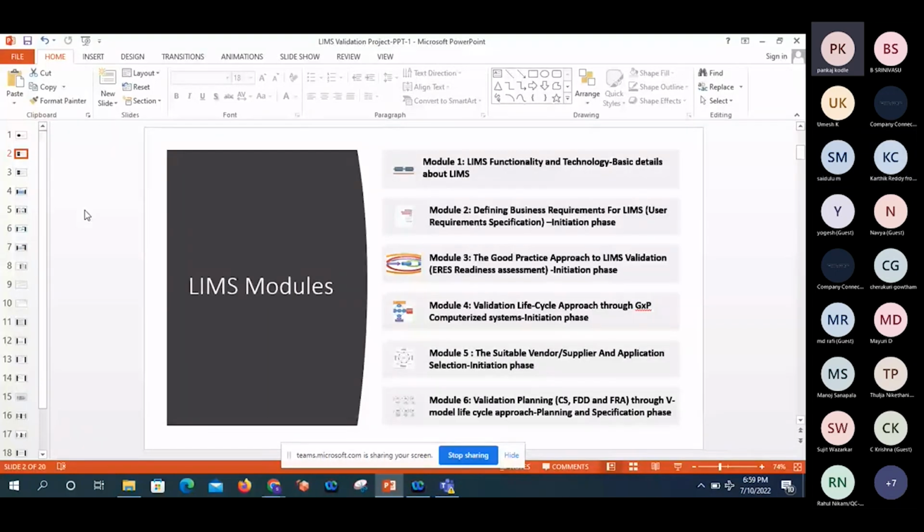At that time, which testing is required? Is it complete validation or some partial testing? Partial only. Which part, in brief? Say, for example, in the first 6 months you've done some validation and delivered to the end user, right? In the 7th month you are going to add one more module, right?